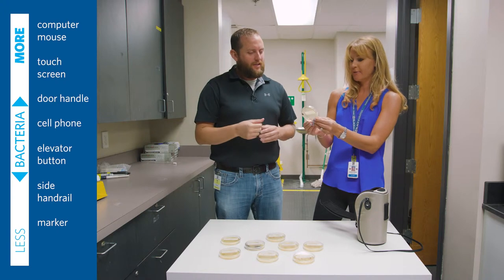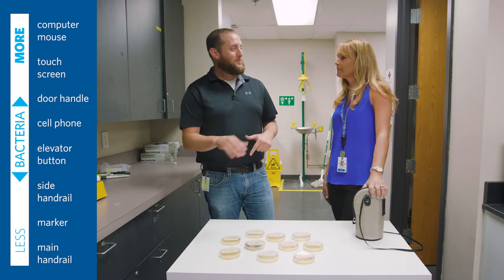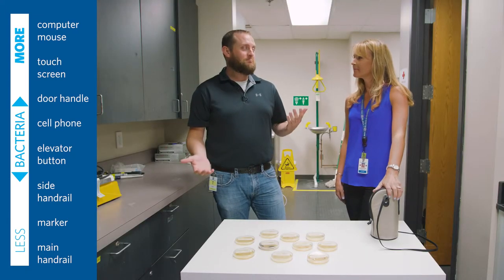Dun-dun-dun. That's really clean. Looks clean. All the ones that we have, computer mouse, by far the worst. By far. But from a handrail side, looks pretty good.